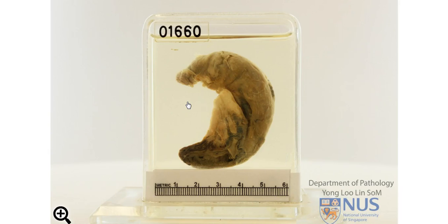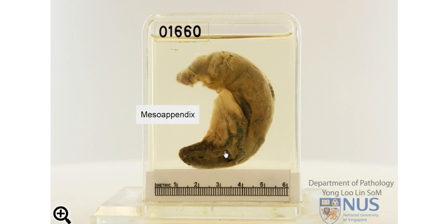Hello, here we're looking at an appendix. This is the proximal end which has been tied off, and here is the tip of the appendix. Just to orientate you a little bit, we're looking at the serosal surface here. This is the meso-appendicil fat, and at the tip region the appendix has been bisected longitudinally.